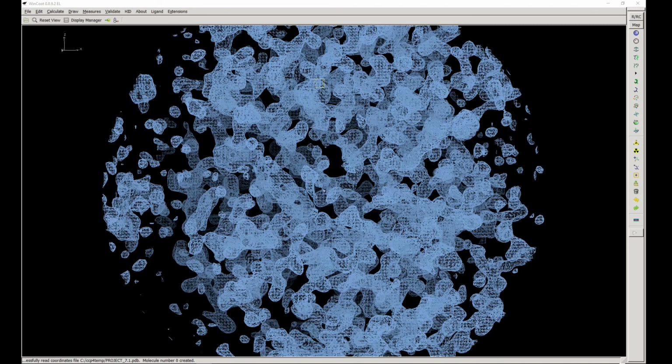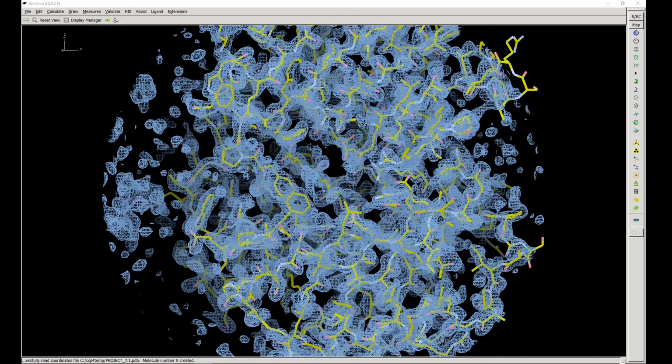So it's pretty close. The sequence identity is about 95%, and we believe the overall structure should be more or less the same. But it doesn't actually change any bond lengths or angles. Phaser just places them. It's up to us to make further changes. So let me turn on the model.